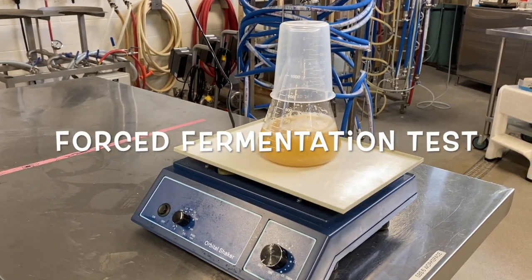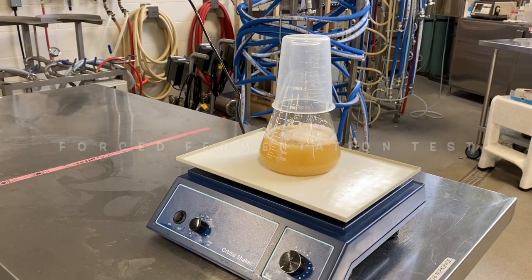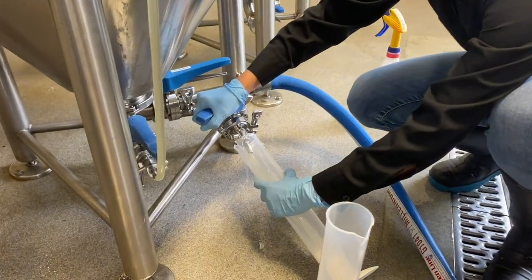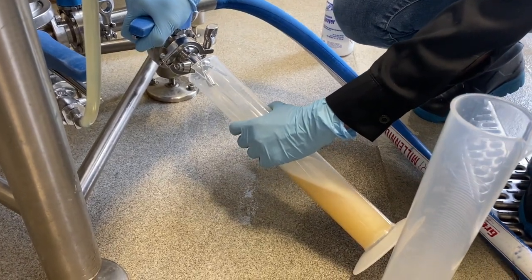The forced fermentation test is used in the brewing industry to evaluate the fermentability of a wort. This test helps brewers predict how a particular wort will behave during fermentation and determine the expected final gravity and alcohol content.